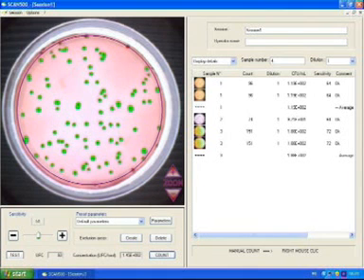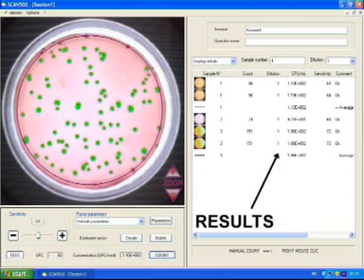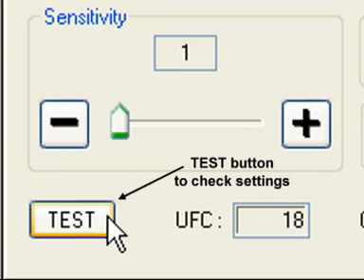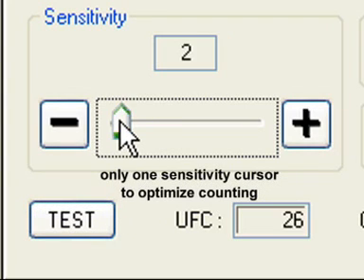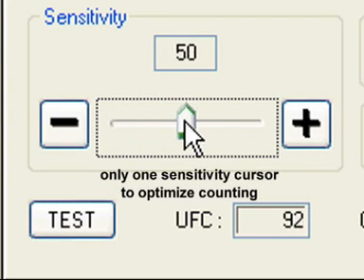The efficient Scan500 software displays a video window, a results board and a parameter area. Its unique real-time sensitivity cursor lets you easily highlight the colonies of interest.